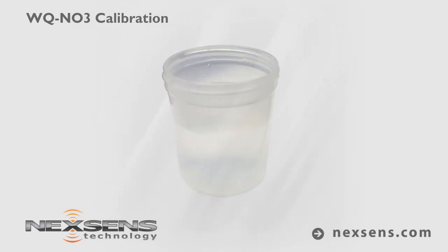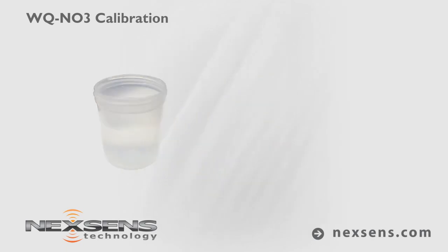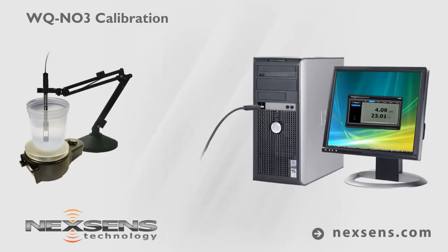Calibration is complete and the probe is ready. Again, use the ionic strength adjuster at a 1 to 50 ratio of ISA to sample solution. Make a measurement by immersing the probe in the sample.